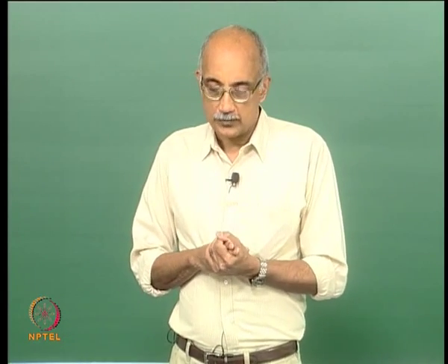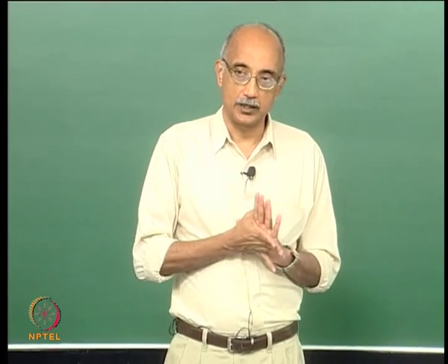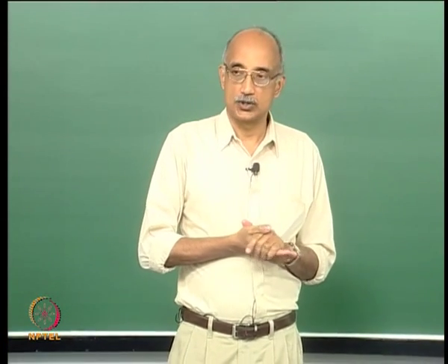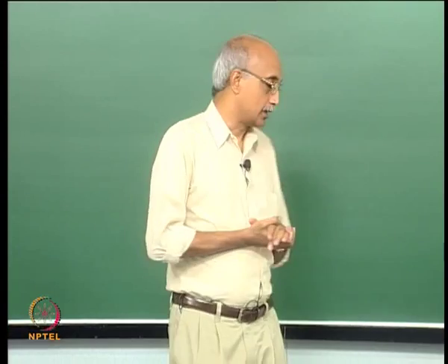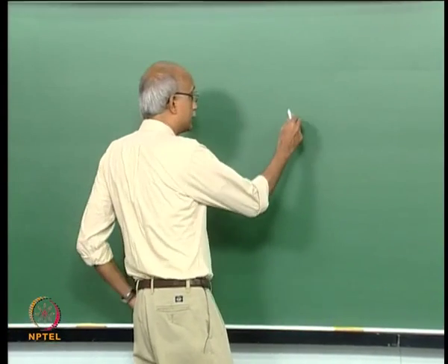But one of the first things I wanted to point out is that there is a formula for calculating the resolution of a microscope, and you are probably familiar with that formula.